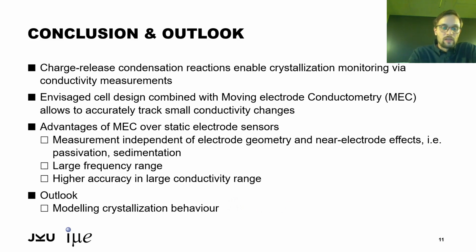The outlook is that we measure more crystallizing samples and hopefully spot weird and surprising crystallization behavior. And at a later stage we want to model these crystallization curves and see if we can link them to modern or classical nucleation theories.